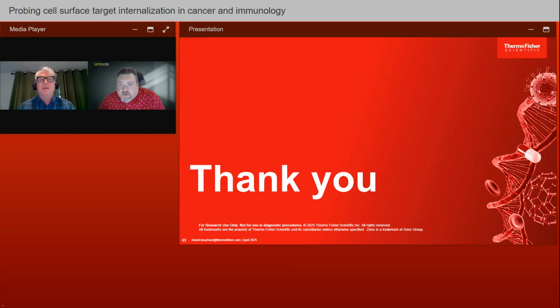Are there limitations of using lysolite dyes for lysosomal localization studies? Well, I showed it has a potent turn-on signal that comes by way of the cleavage of the cathepsin recognition sequence in the dye, that separates the quencher from the dye itself.